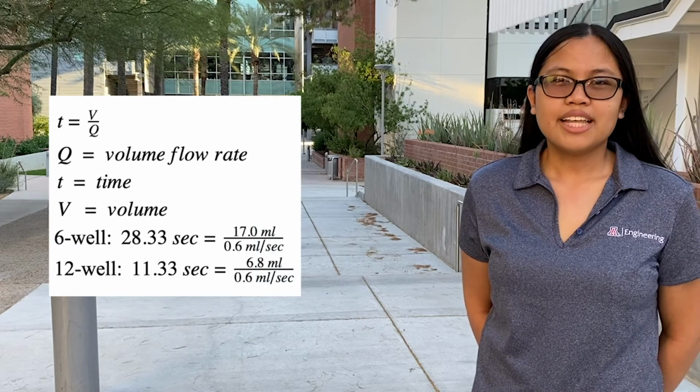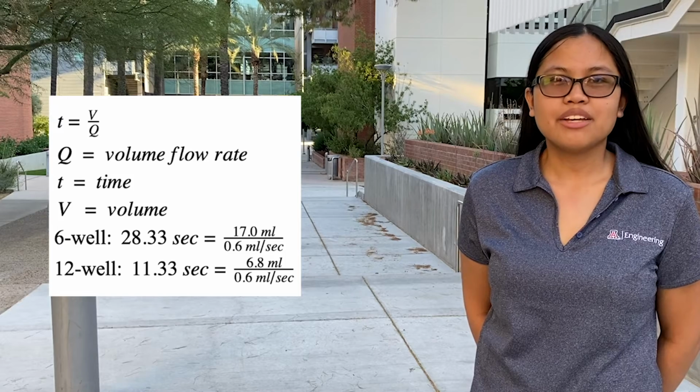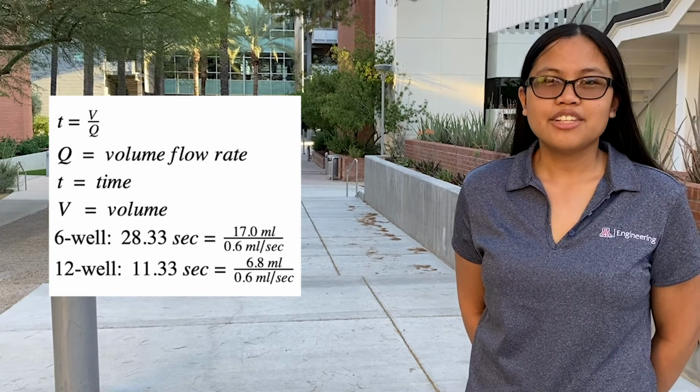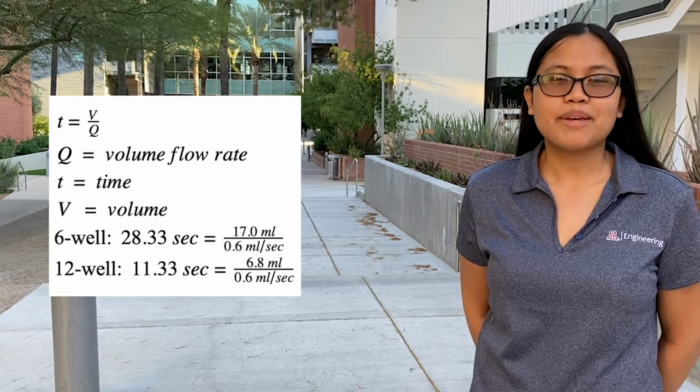The fill rate allowed us to analyze the time required to fill the wells. Growing tissue should not be left without medium for more than 2 minutes, and we found that our chosen flow rate of 0.6 milliliters per second allowed the system to complete the exchange process in less than 1 minute, even when dispensing the maximum volume.